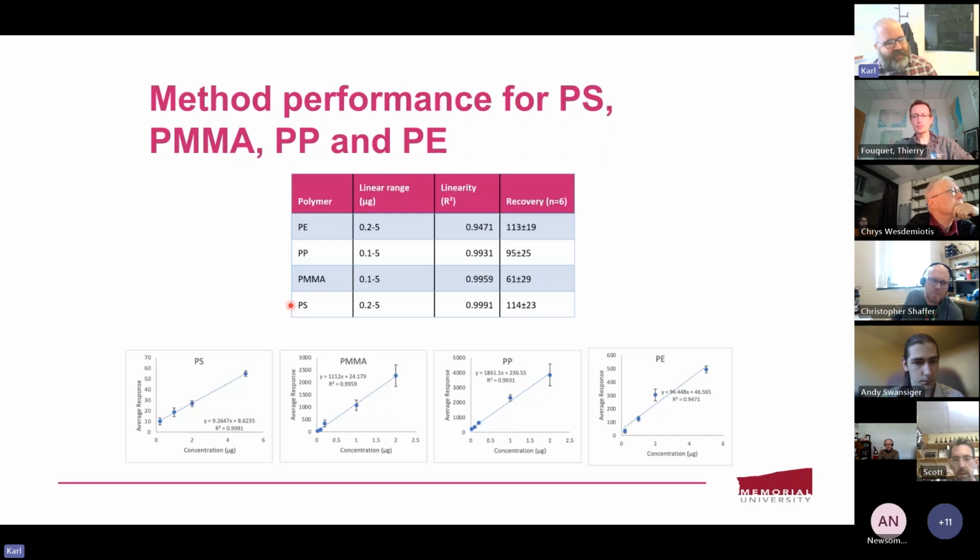For the polypropylene and polyethylene samples, on the other hand, what I've seen in other work is that the products are alkene products. They're not very specific, and there could be lots of other things that produce those small pyrolysis products. So one advantage of our setup is that we've coupled GC to the instrument by APCI. That's nothing special; it's what Waters offers to connect their GC, and that allows us to monitor much higher molecular weight pyrolysis products.